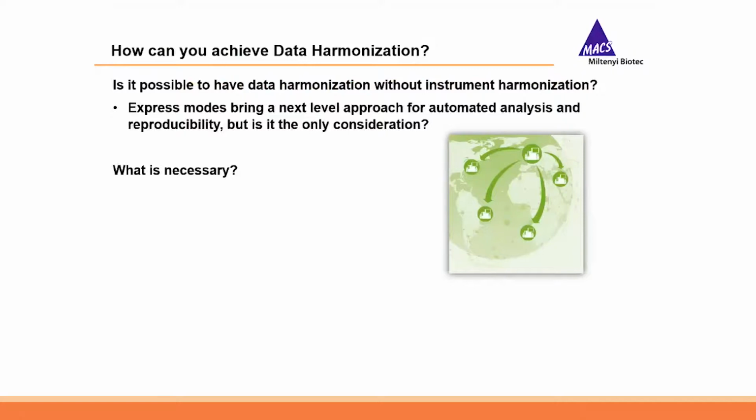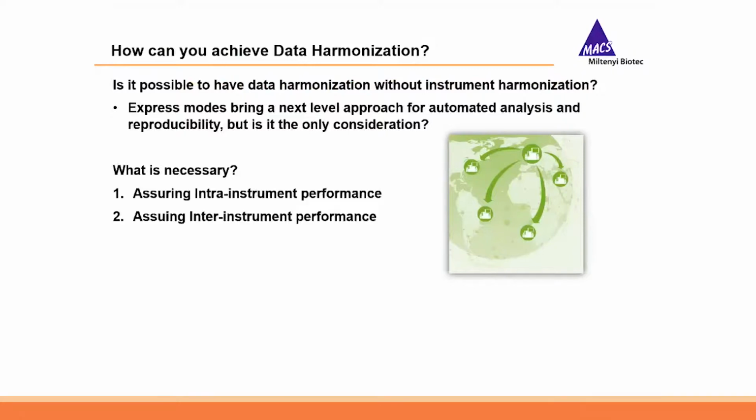What's necessary? To deliver that reproducibility, you really have to have assurance in intra-instrument and also inter-instrument. So let's take a look at some of the considerations to achieve multi-instrument harmonization.